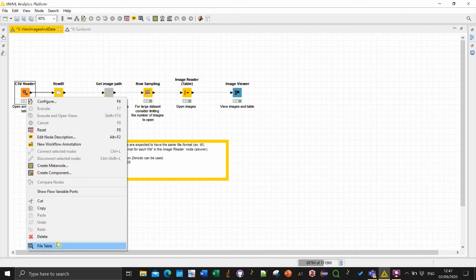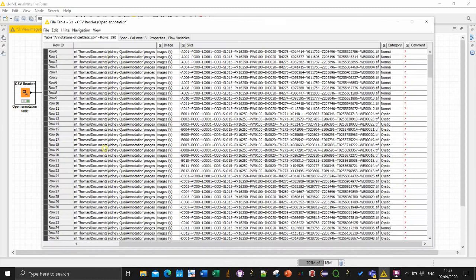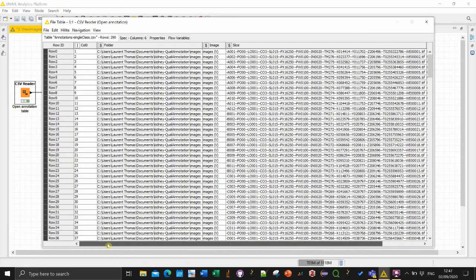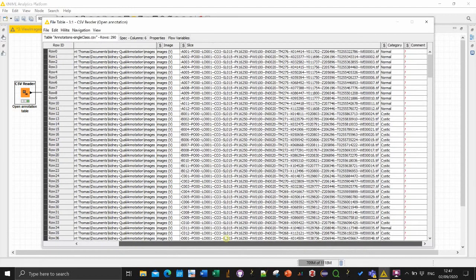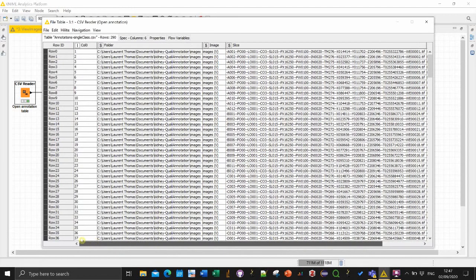And then if you open, if you selected open views you will get a table automatically otherwise you can click here to go to the file table.